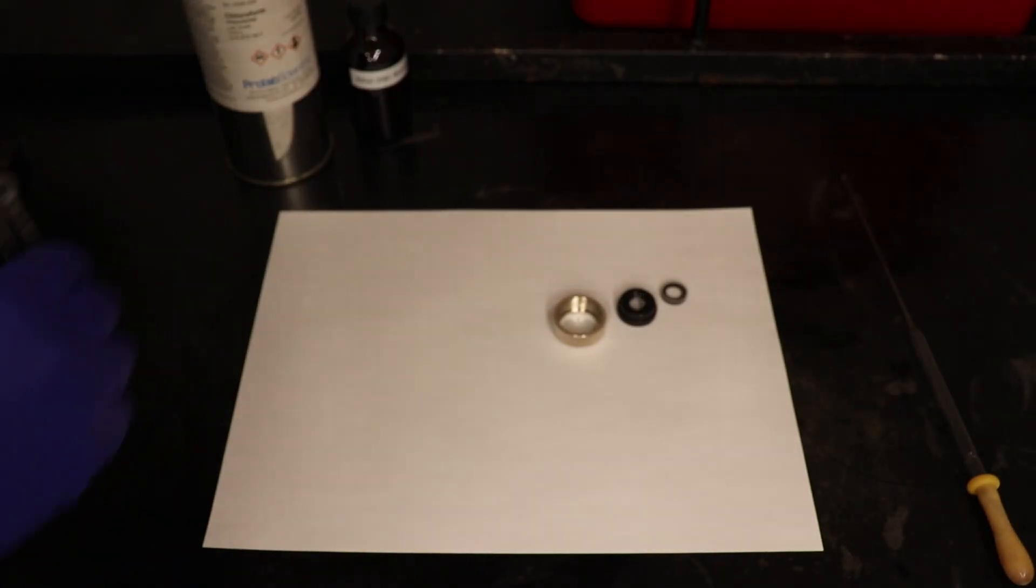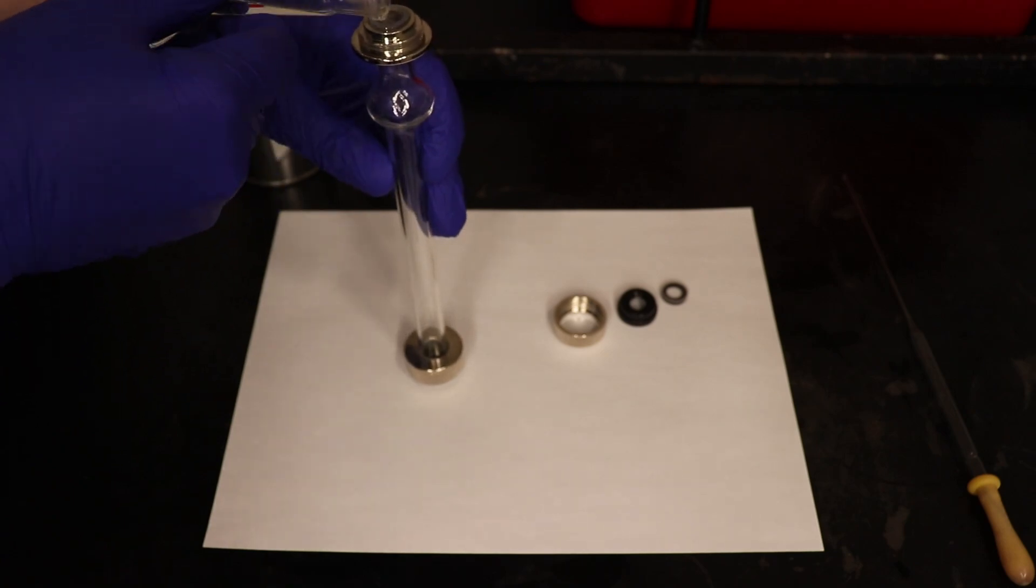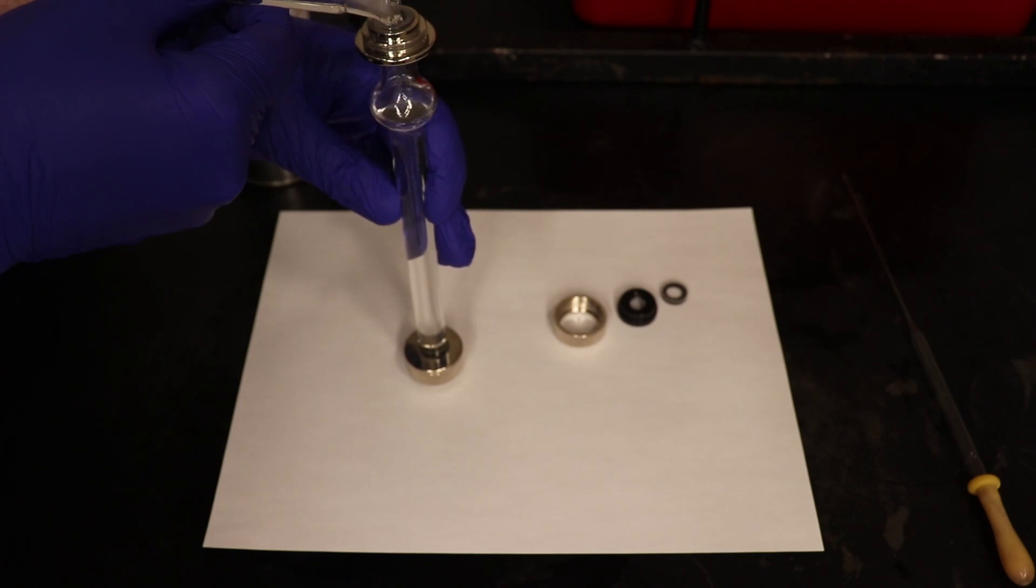Since I started with naturally derived L-alanine, the product should also be the enantiopure S-enantiomer. And the easiest way to check that is by measuring the optical rotation of the sample using a polarimeter.